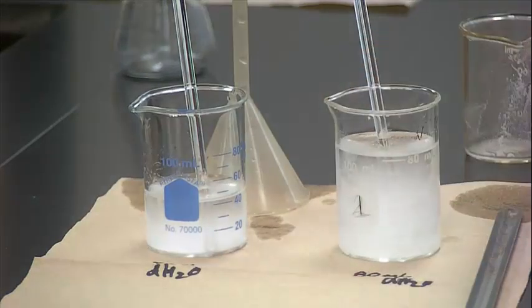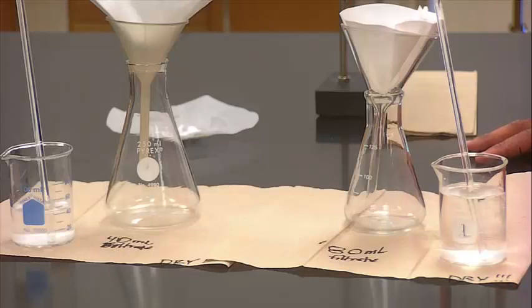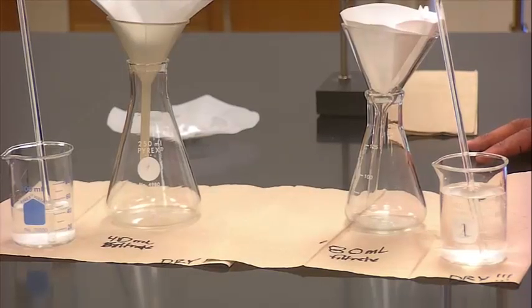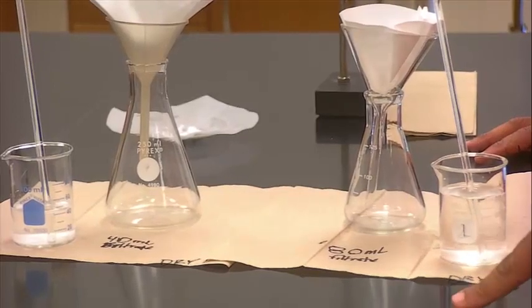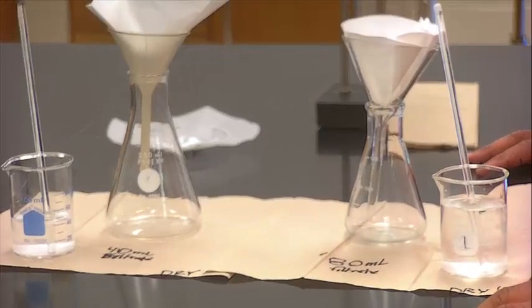And it's going to take about 30 minutes or so for this precipitate to settle. So during the 30-minute wait, you can go on to the next phase of the experiment. It's been about 30 minutes since we've collected our wet calcium iodate precipitate, filtered it, and put it in some water. In this case, we put it in 40 mils of DI water.